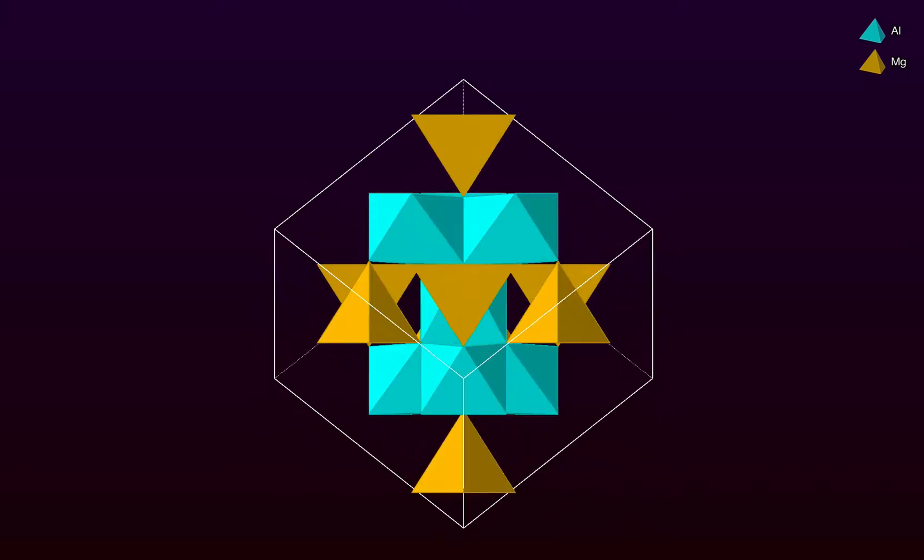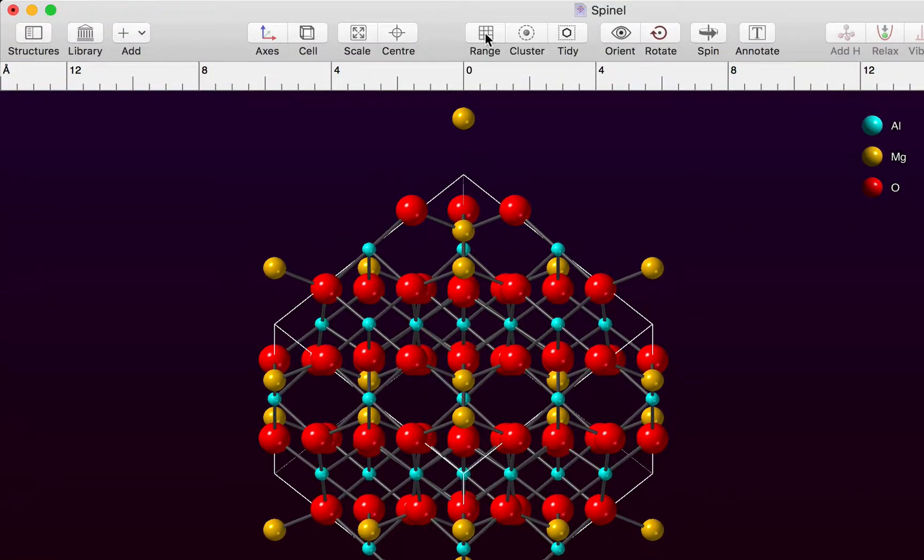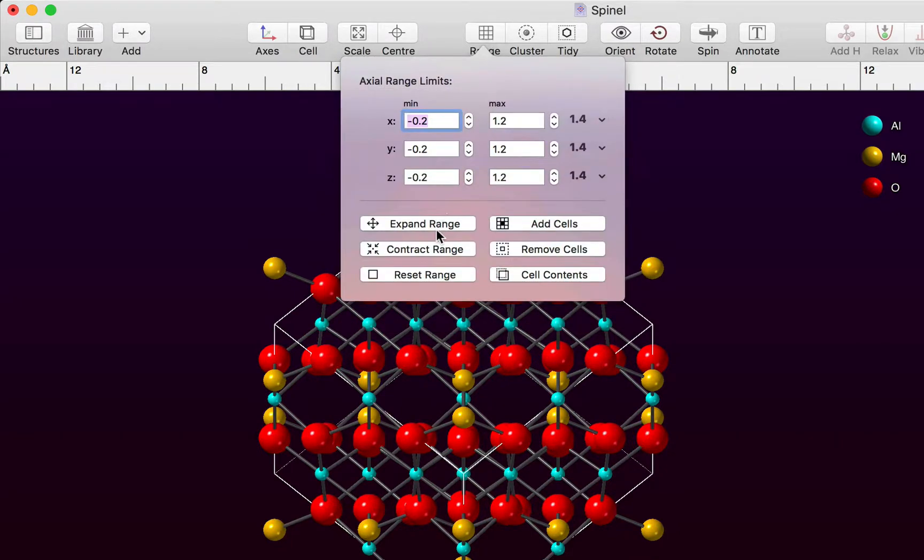We'll start with the polyhedral model of spinel that we built in an earlier tutorial. I'm going to switch to a ball-and-stick model now and I'm going to use the range command to expand the plot range slightly.